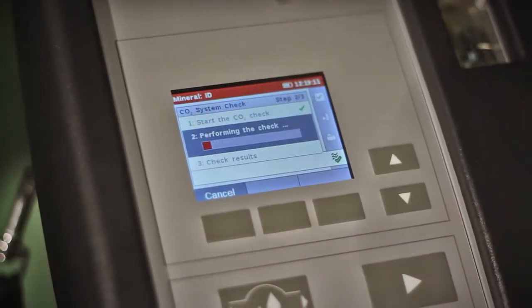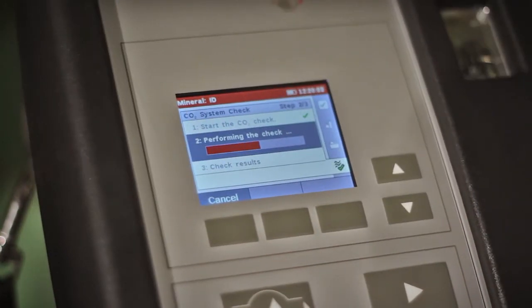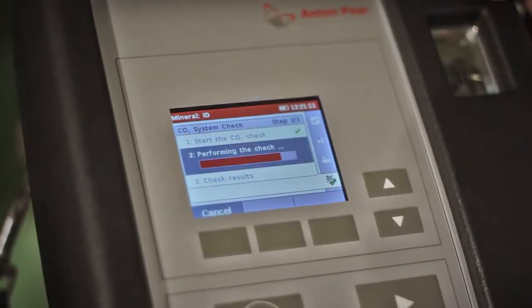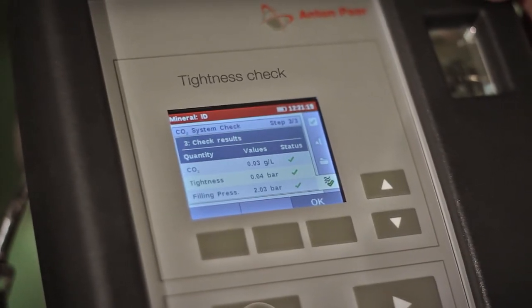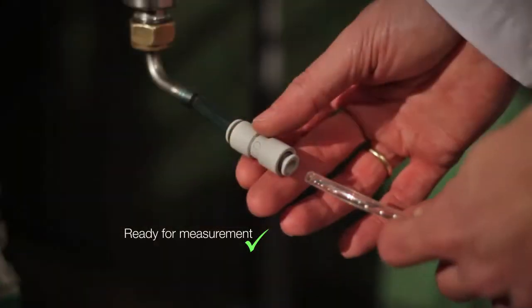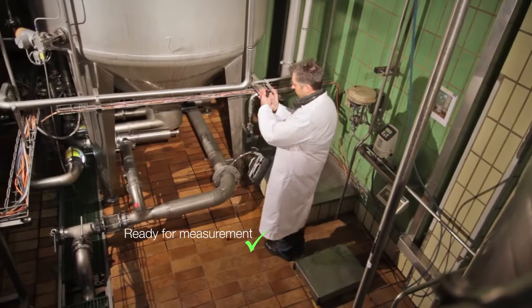You can have the system automatically check the zero point of the CO2 measurement and the tightness of the measuring chamber. These check results give you a reliable go for a long working day.